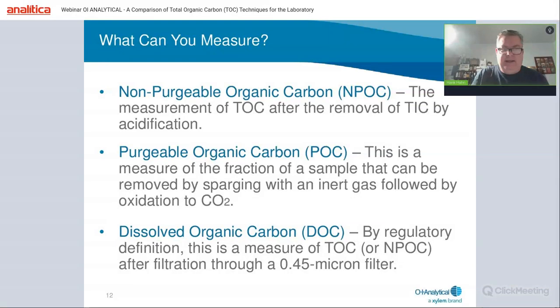There's POC. This is a measure of the fraction of sample that can be removed by sparging with inert gas. DOC, by regulatory definition, is a measure of TOC or NPOC after filtration. You also see people mentioning DOC as well with TOC, and you also see DOC where people are talking about seawater applications.